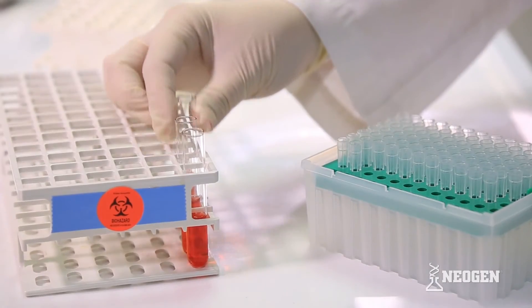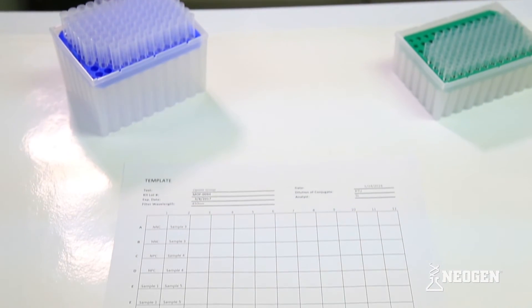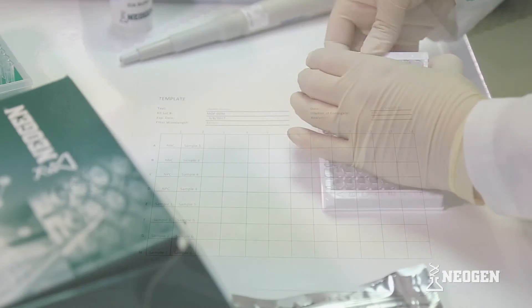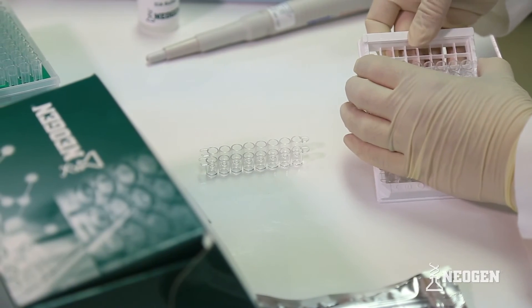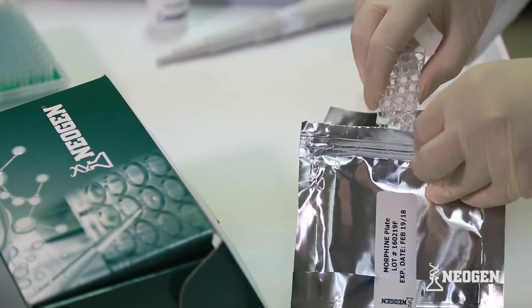Remember, it is recommended that controls and samples are assayed in duplicate. You may find it helpful to create a plate map to track which samples are in each well. If you are only running a partial plate, gently pop out any unneeded strip of wells and place them back in the bag with the desiccant bag so that they may be used at a later time.